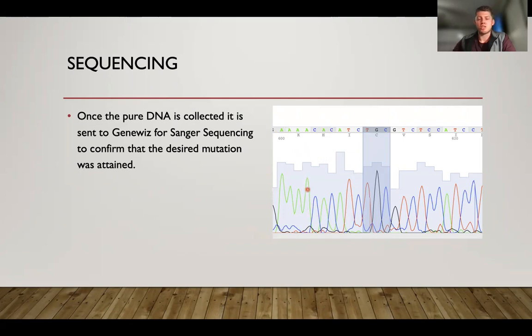We are able not just to make sure that the mutation of interest is present, but that others are not. And reading this, you can see that there are peaks for each respective nucleotide that occur at greater strength whenever that nucleotide is present.